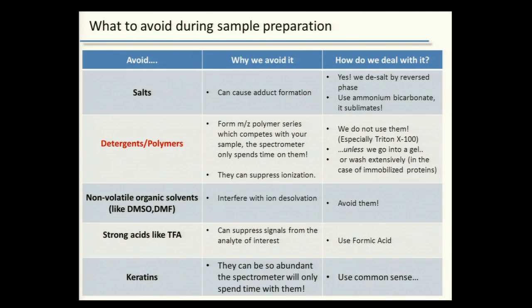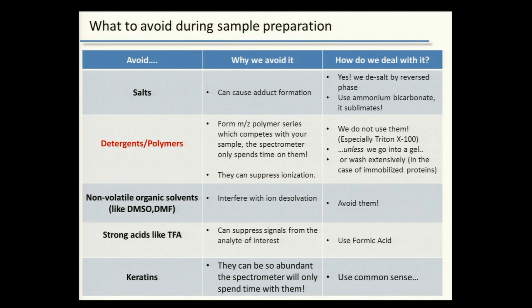And then the infamous or famous keratins, and that's just basically skin dust. We can't really avoid them. They're very, very abundant. They're in the air, but there are ways to avoid them. Use clean materials when you're putting your gels in there, when you're handling your sample. Use gloves, tie your hair. Try not to cough and spit in your sample, which sounds like a very prosaic thing, but it makes a huge difference because if not, all you're going to be seeing are skin proteins.